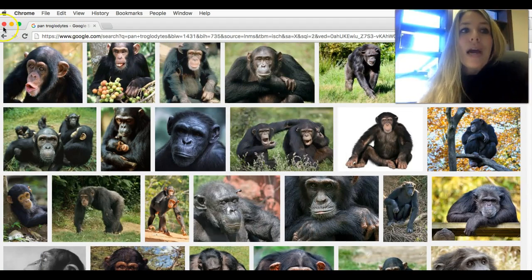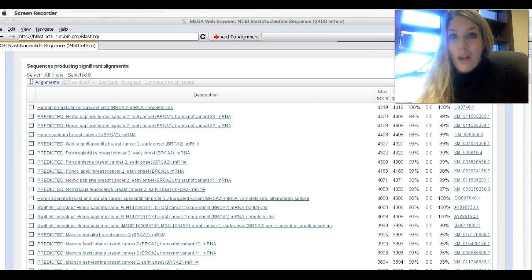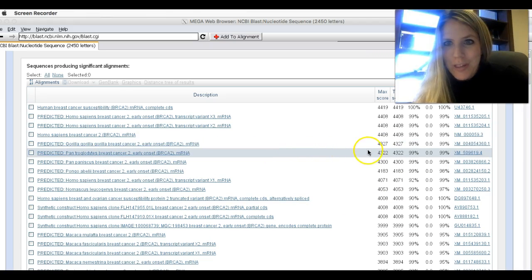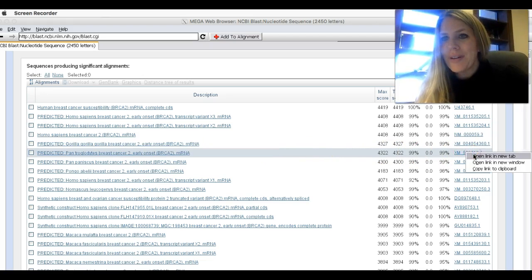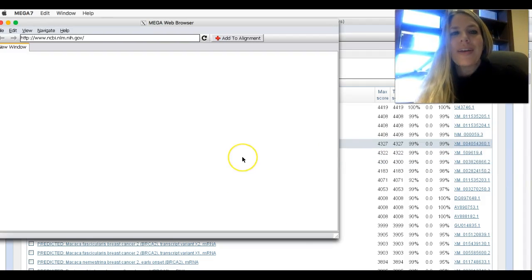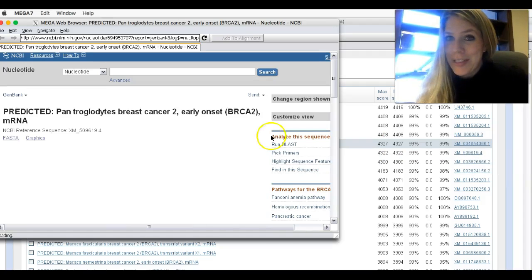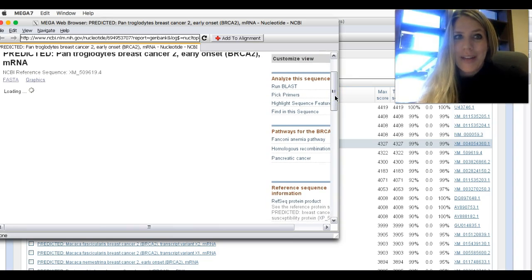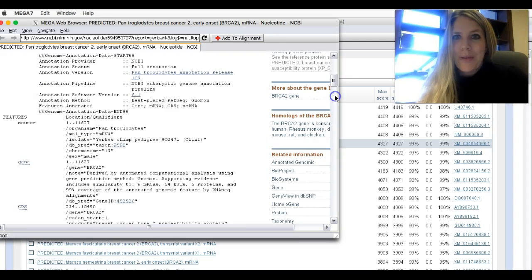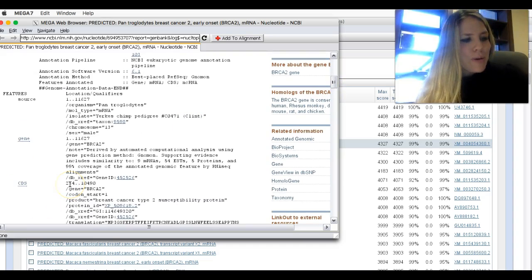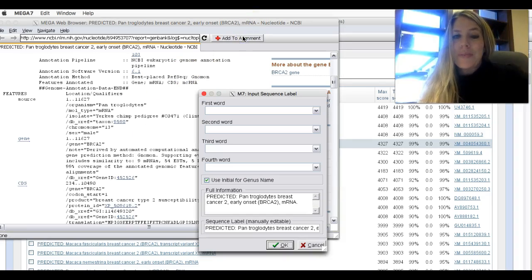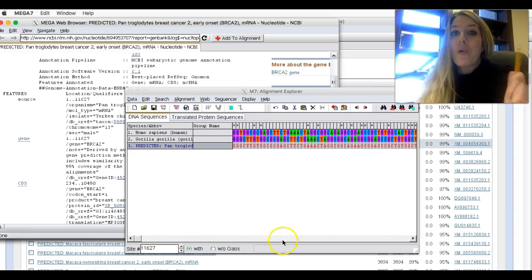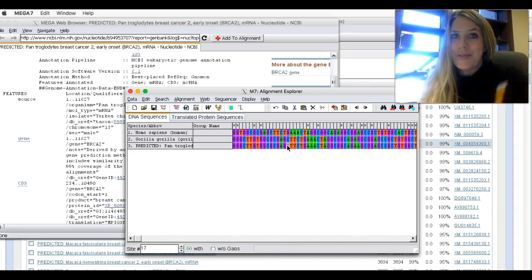Now I know that Pan troglodytes is a chimpanzee. So let's go ahead and add the chimp here. I'm going to go over here to Pan troglodytes and go on the accession number. Open a new window. We're going to enter the coding sequence, the start code. We're going to scroll down as it loads up. Go down to CDS. Write down that first number, which is 234, just like in the gorilla. Add to alignment. Hit OK. So we're going to keep doing this. In the next tutorial, I'll add a few more and we'll continue on.